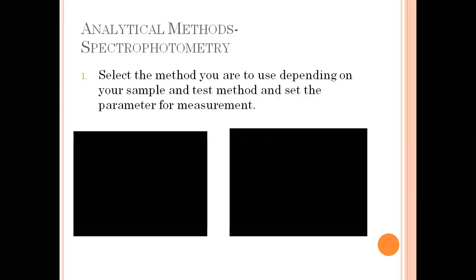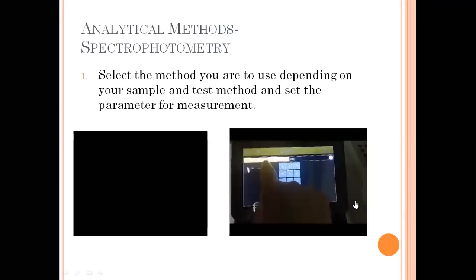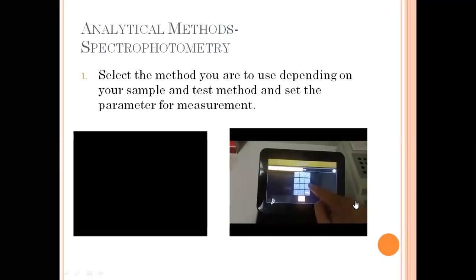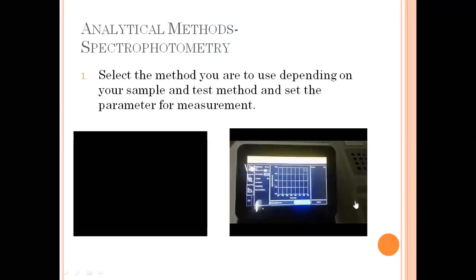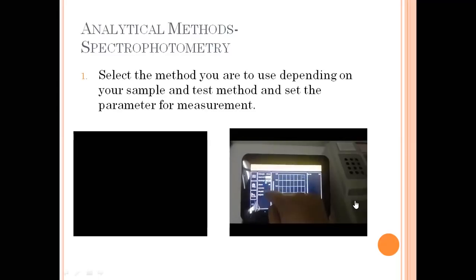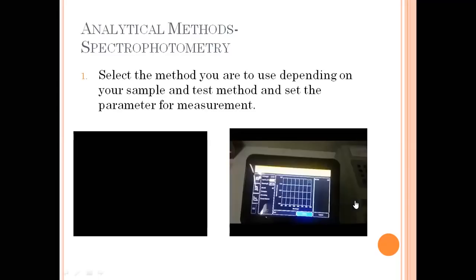So, nag-stop siya, no? Ulit. Play ko ulit yung video class, ha? Ayan. Setting the parameters, the wavelength needed depending on the test. So 340 yung nilagay ko for that specific example. Okay? And then by tapping on that hit to 37, nag-color orange na siya. So pag nag-green na yan, sabi ko nga sa inyo, it indicates that the temp is at 37. Okay? So I'm not sure why nag-i-stop. However, iyon lang naman yun.